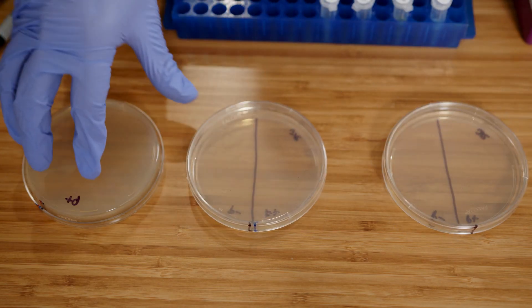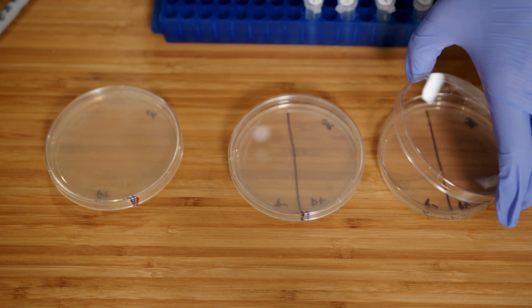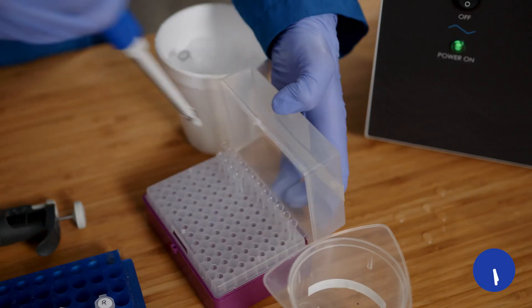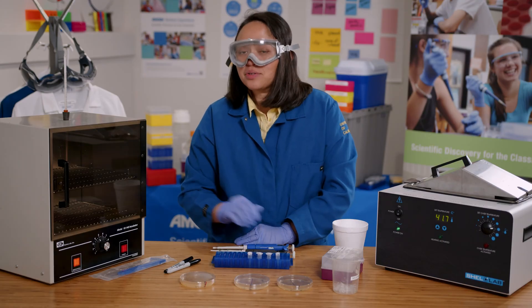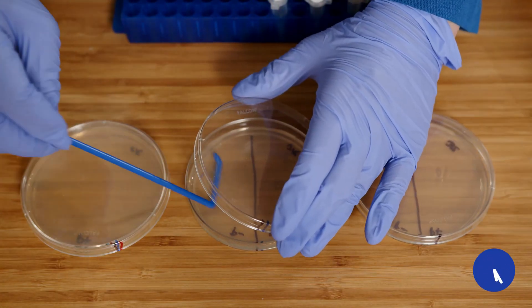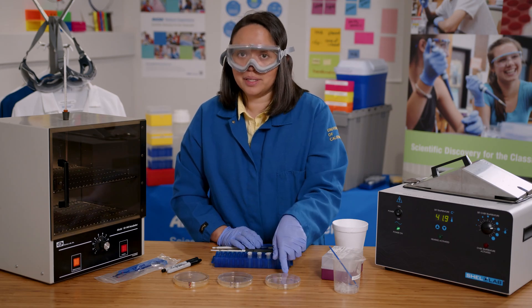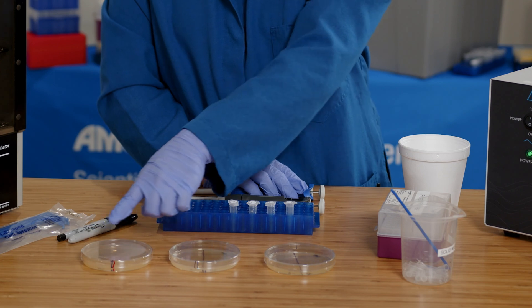Now I'm ready to plate the cells. Anytime I open the lid, I will only open it slightly and on one side like a clamshell, and close it right away to prevent any unwanted contamination. I'll start with the P- tube and pipette 50 microliters on the LB and LB amp plates. I'll use a cell spreader to spread the cells on the LB plate first and then on the LB amp plate, because I don't want ampicillin to get on the LB plate. I will do the same with the P+ tube, and I will also add 100 microliters on the LB amp arabinose plate and spread it over the entire plate.